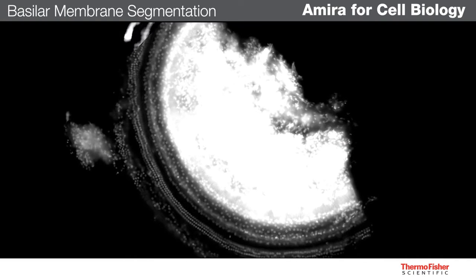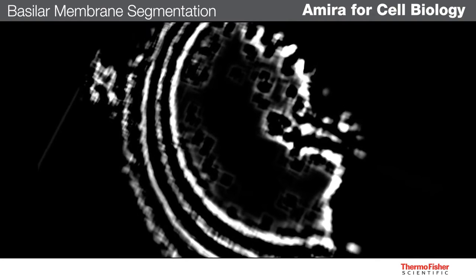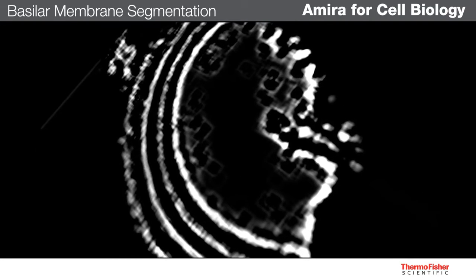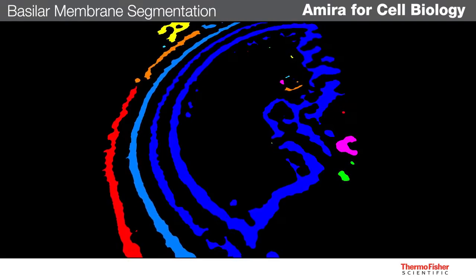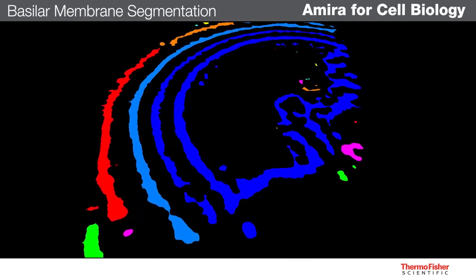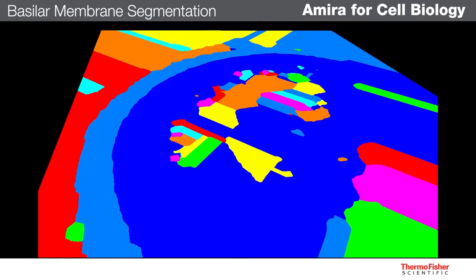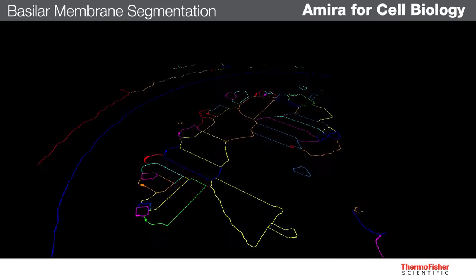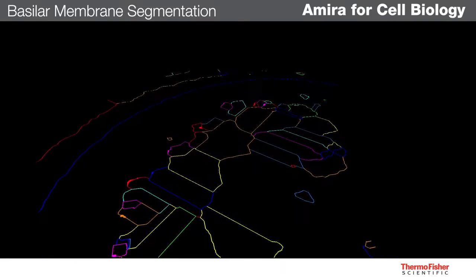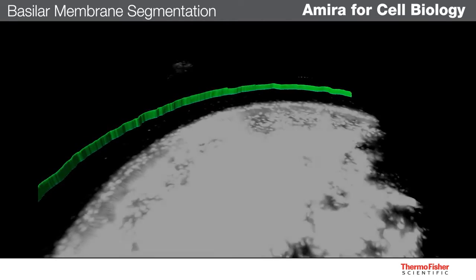Since it's difficult to directly threshold this gap by itself, we will begin by filtering the image to accentuate all gaps. We can then highlight the edges of the gap with an automatic threshold. Then we can use a watershed algorithm to grow these edges together until they meet in the middle of the gap. Only the middle of the largest gap represents the membrane, so we need to mask everything outside the region of interest, then filter out all other watershed lines.